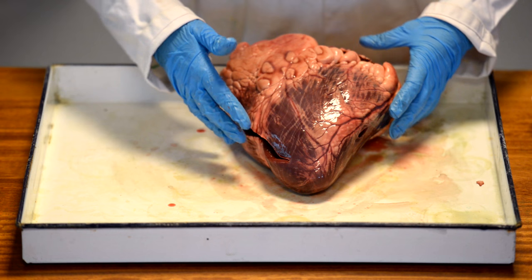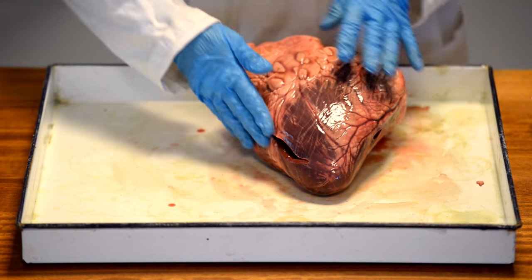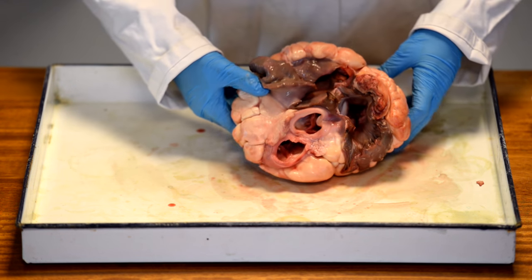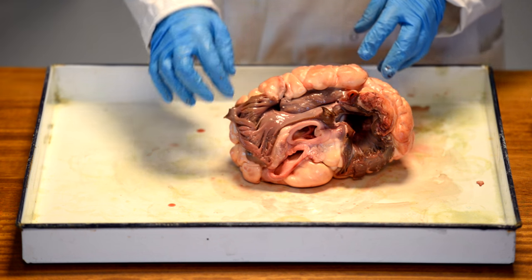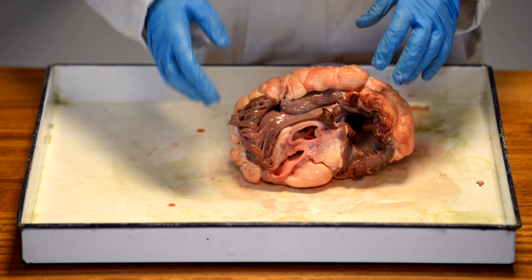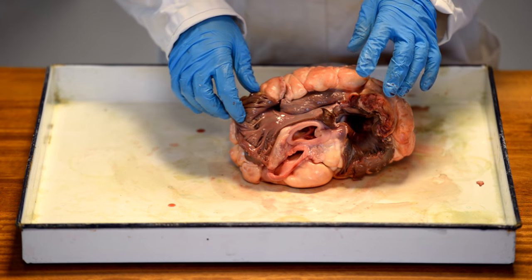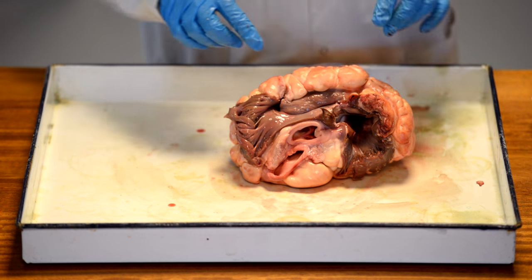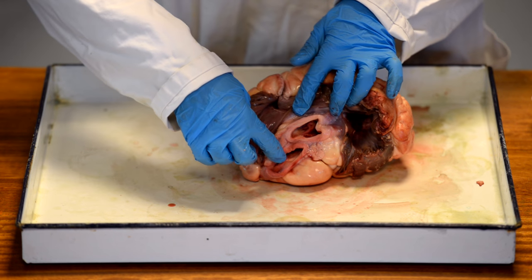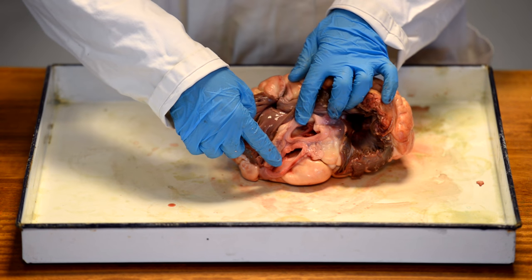So before we go inside, and all hearts, by the way, that come from butchers are slashed, so we're going to ignore that slash there. Before we go inside, let's have a little look at the top of the heart. Now, this has not been dissected out, it's just been cut out. And so what has happened is that the butcher has cut away a lot of the tissue at the top. But what he's revealed for us, which is very interesting, is the two major blood vessels leaving the heart. These are both arteries.